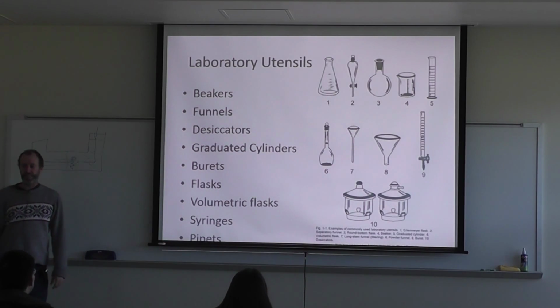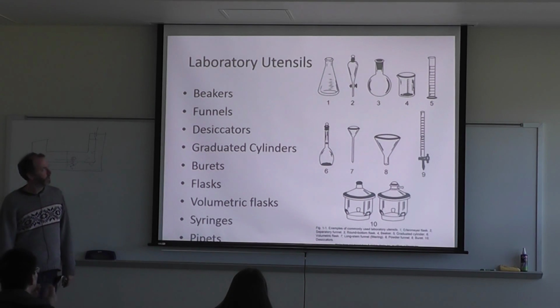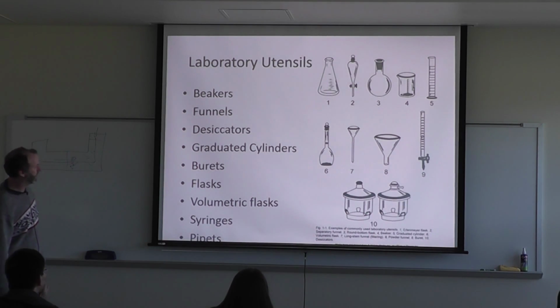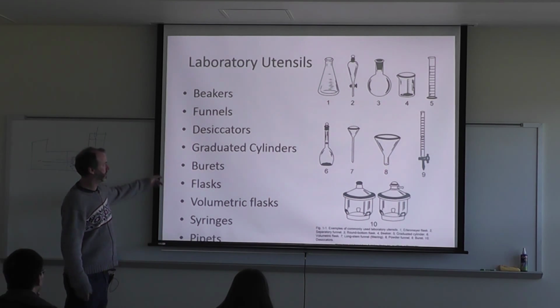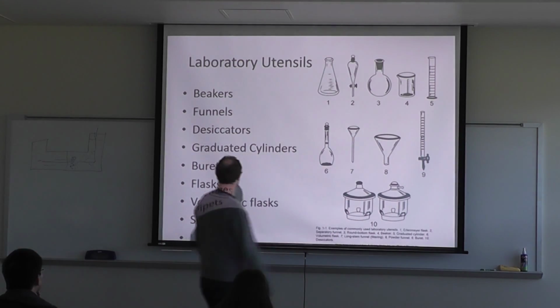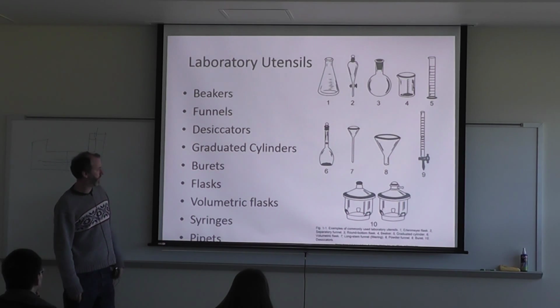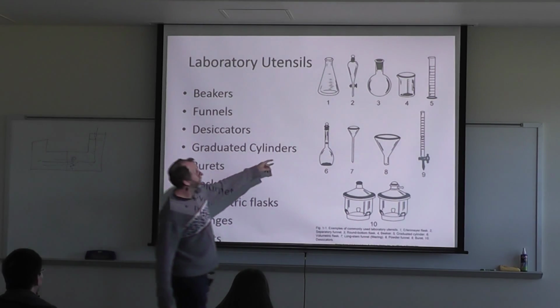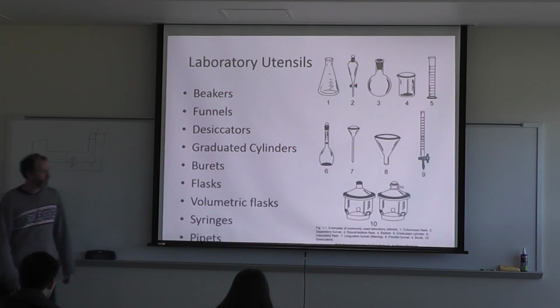You guys have seen these before, right? Or any of these you don't know? So we've got beakers, funnels, desiccators, graduated cylinders. These are graduated cylinder, burette, funnels, flasks up there, volumetric flasks. This is a volumetric flask, right? Syringes and pipettes.